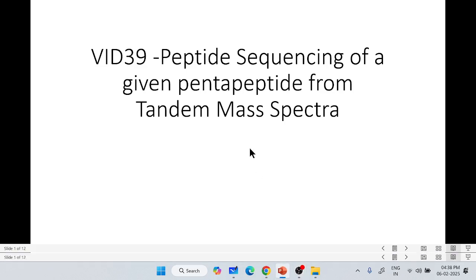Hello students, in response to a query from an overseas student, I am making this video. This video concerns the peptide sequencing of a given pentapeptide from its tandem mass spectra.